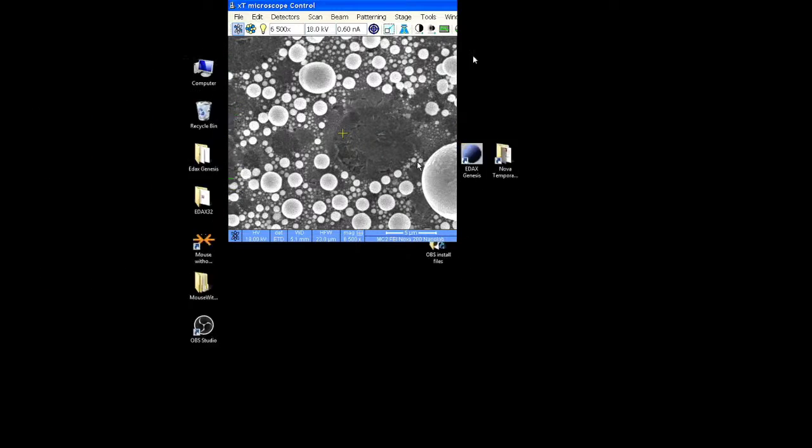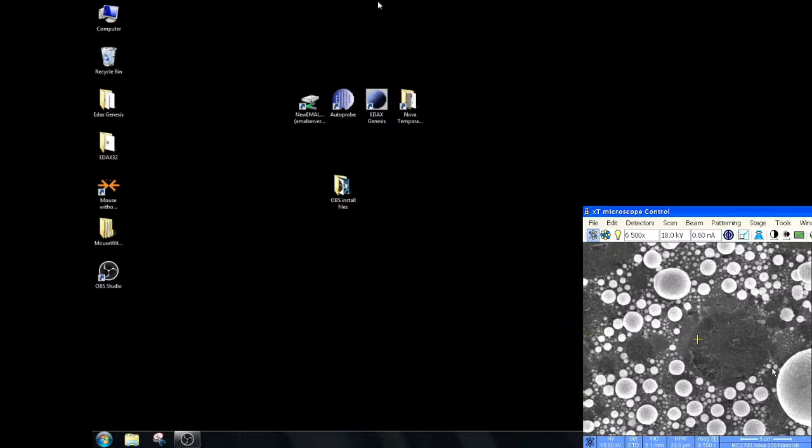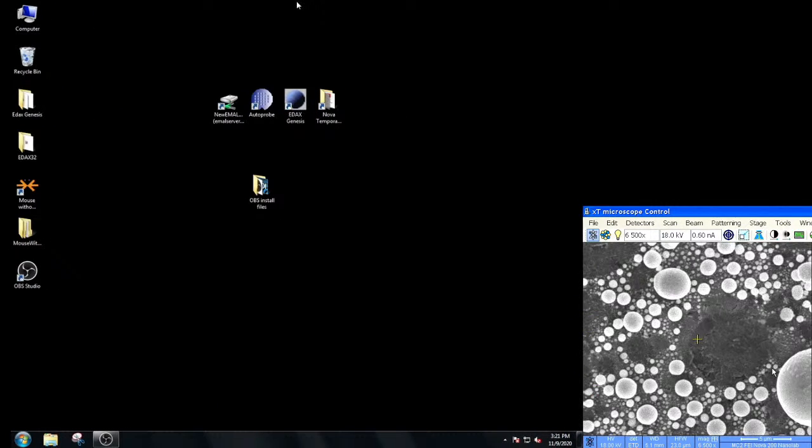Okay, so there's our SEM image, and we'll just park this down in the corner. Oh, look at that, there's enough room for both.